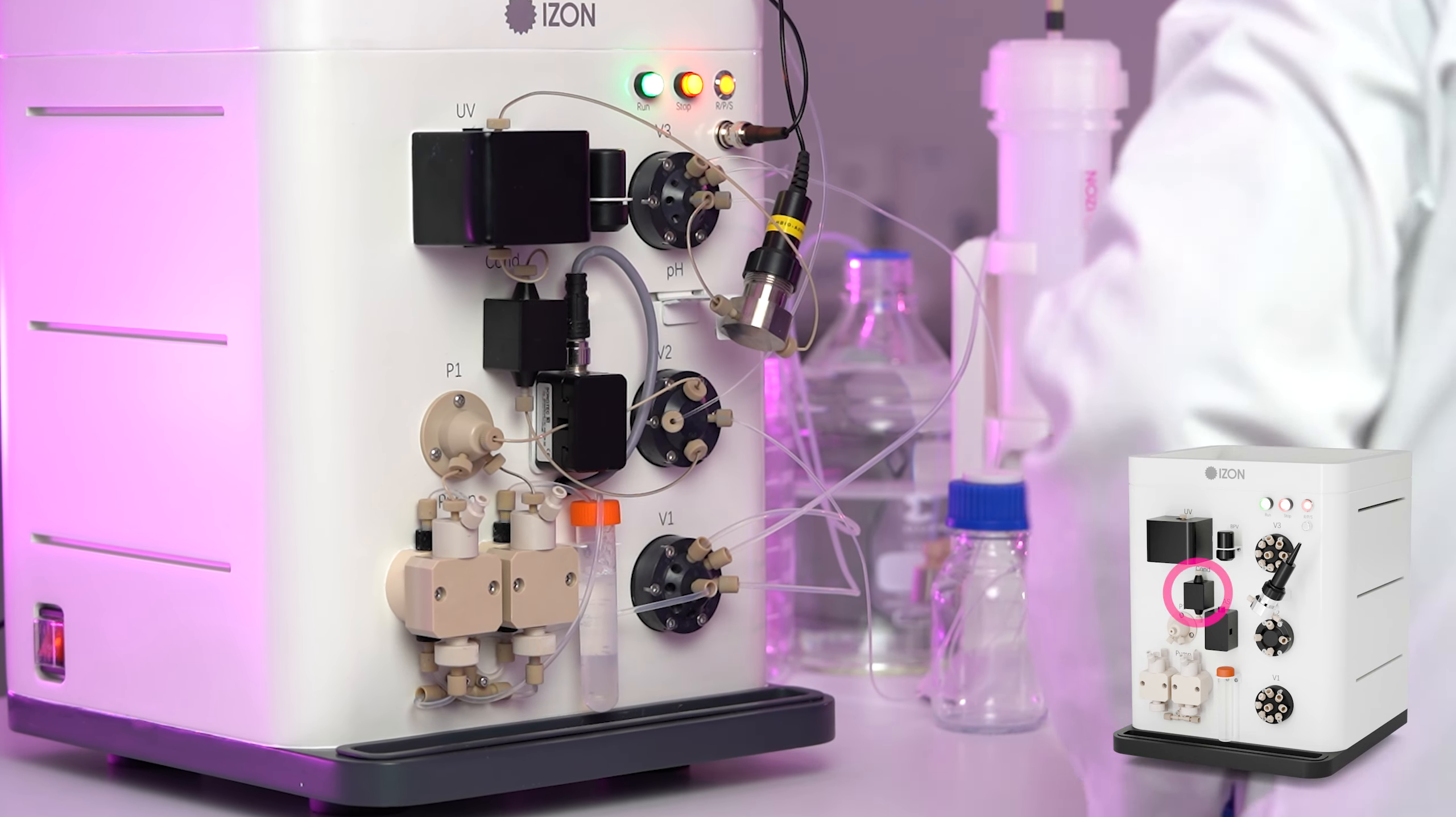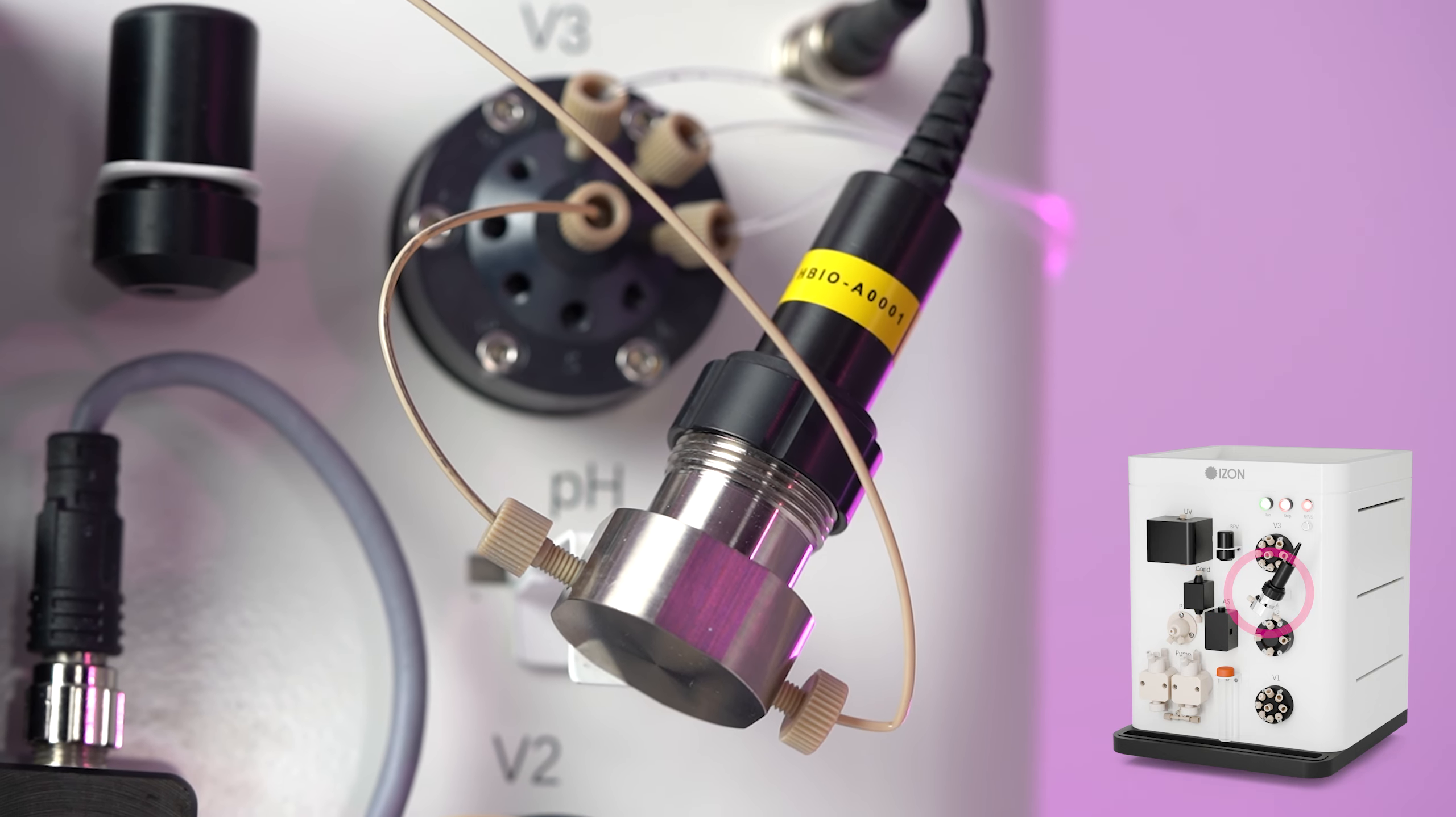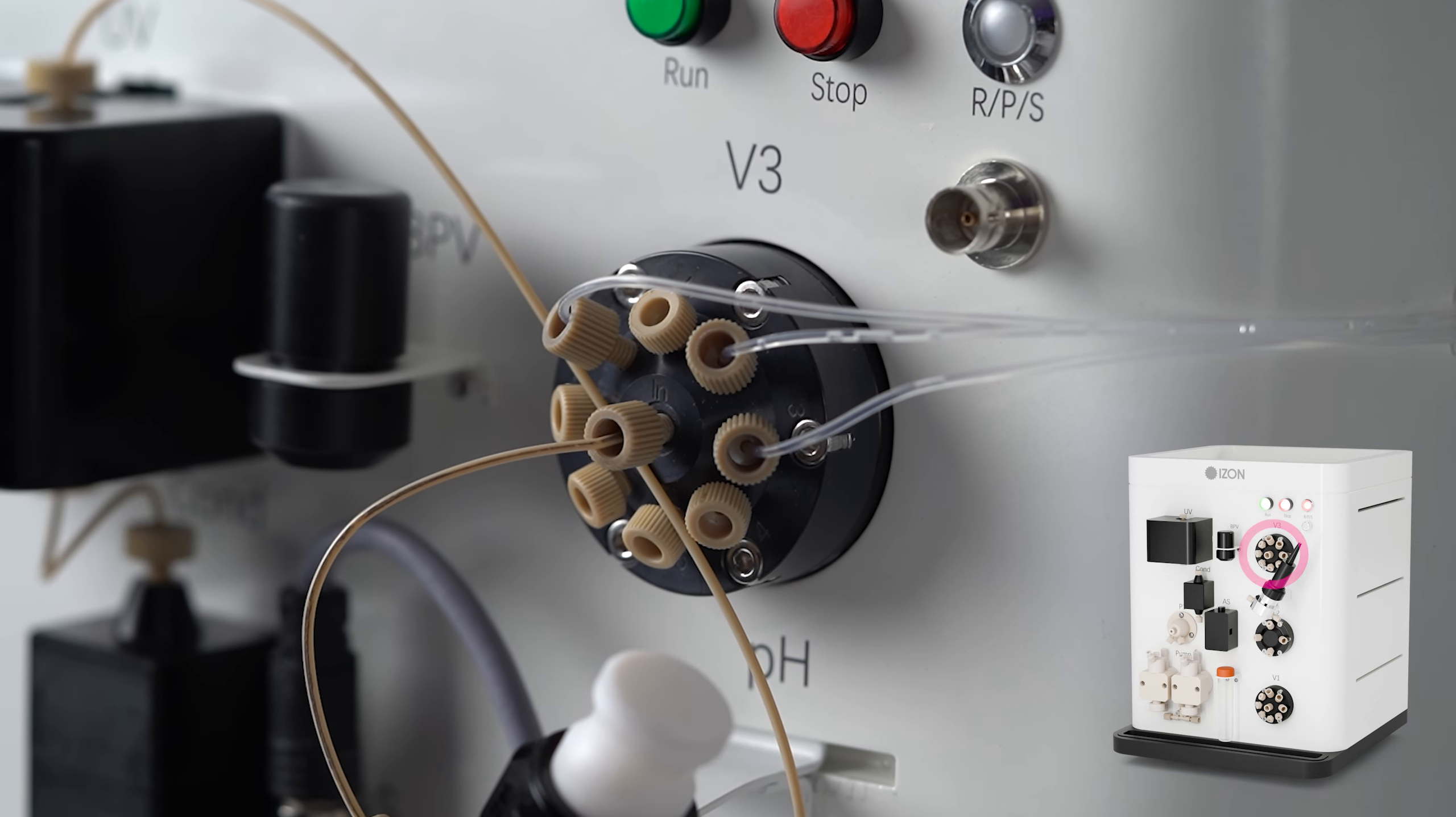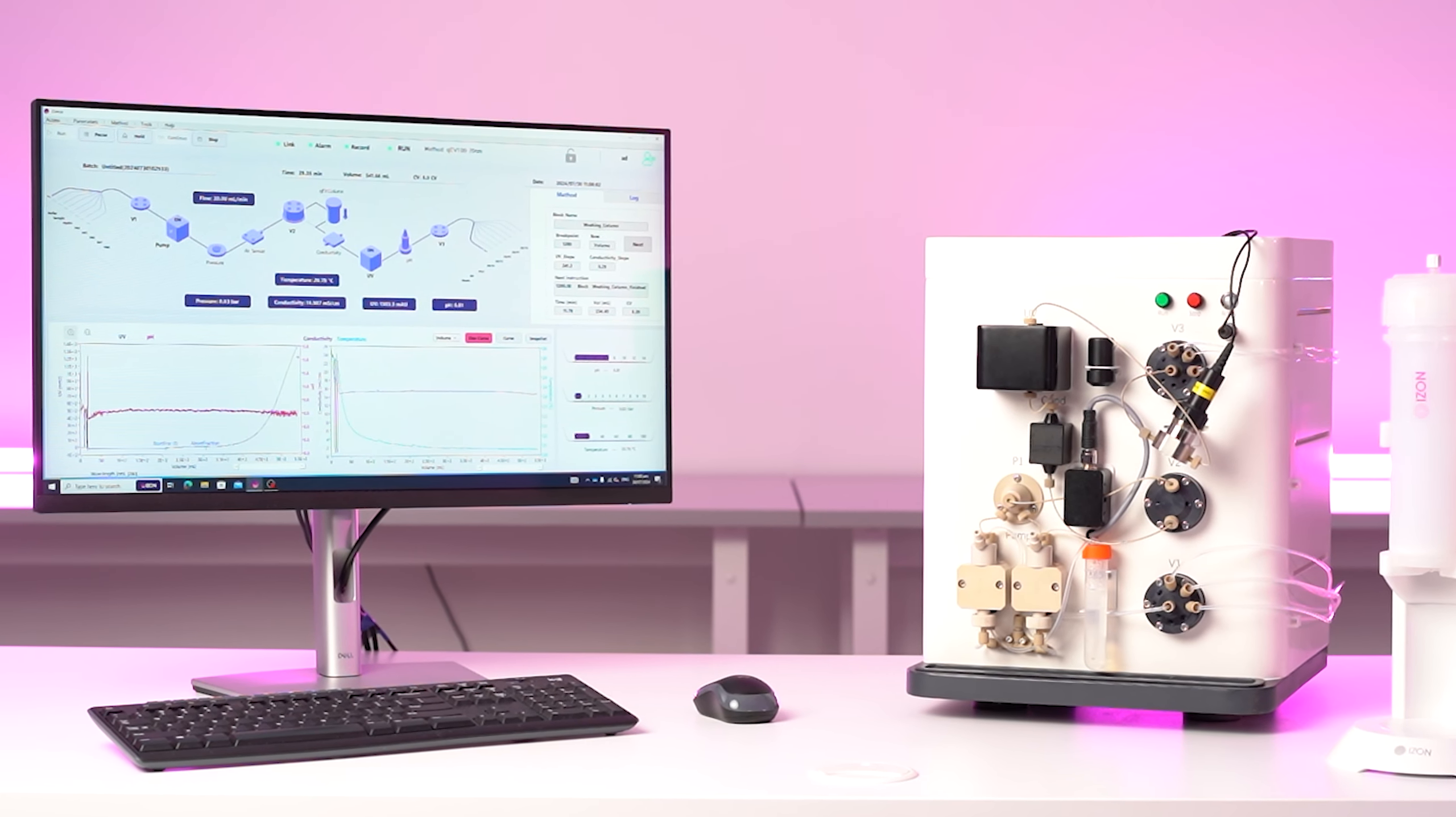Post-column, the liquid passes through conductivity, UV and pH sensors for analysis. At the third valve, you have eight outlet options to control which volumes are collected or sent to waste.